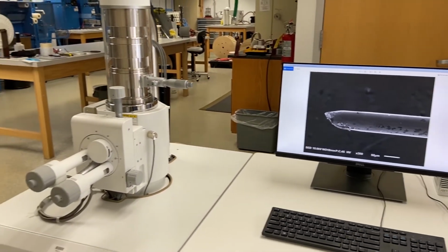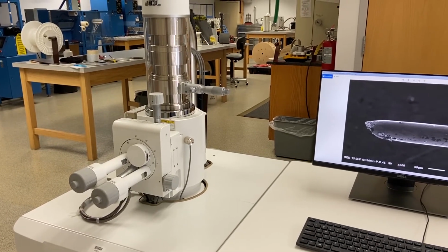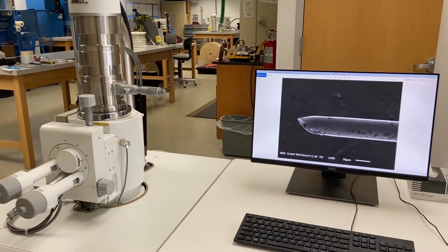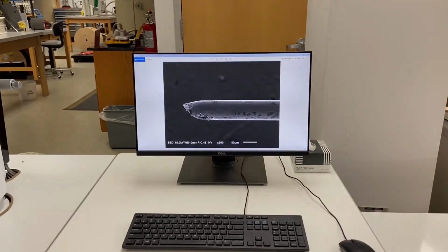New England Wire Technologies uses the SEM EDS for failure analysis, for example to aid in the examination of wire breaks, contaminant identification, and identification of materials in customer samples.